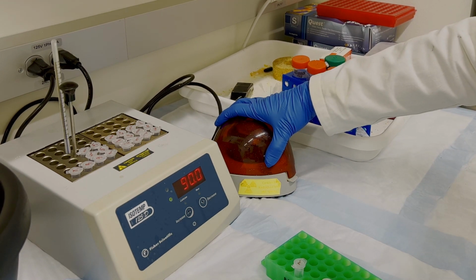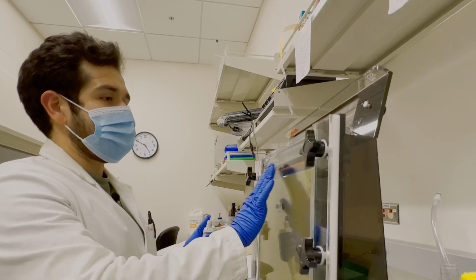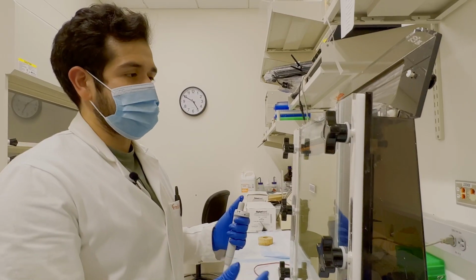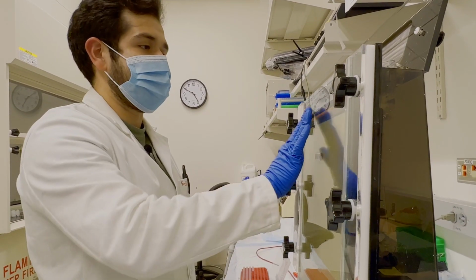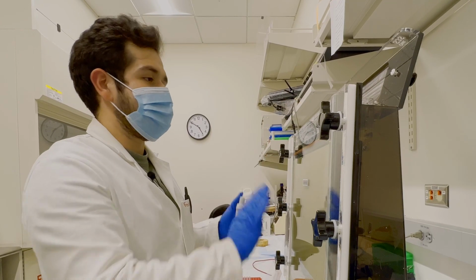Before adding a sample onto the gel, as you can see here, I've actually marked where I should not put a sample. I marked them by using this red Sharpie here, for example, and this will just make life more simple for you. You won't have to remember exactly what well didn't form very right or where the bubble is. As long as you mark it, you should be fine.